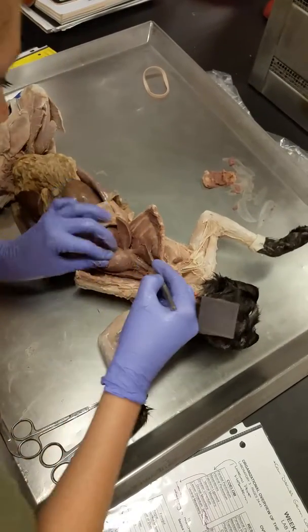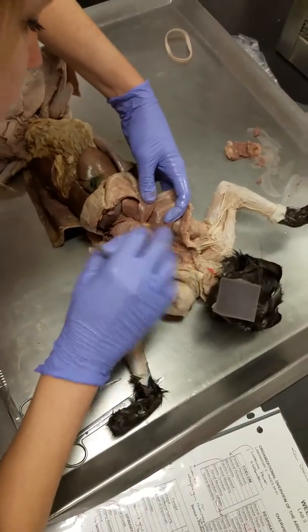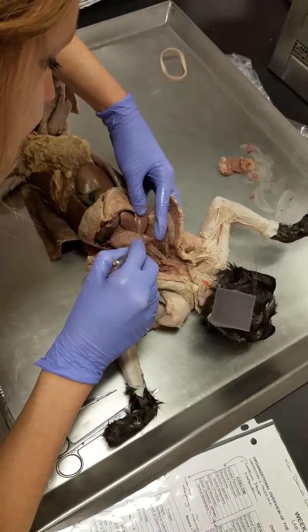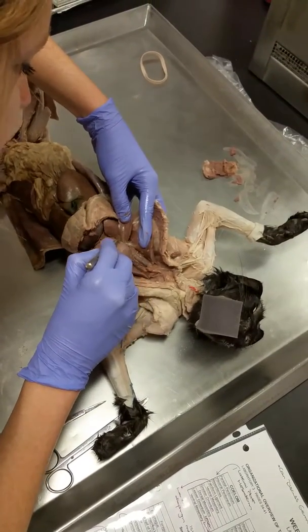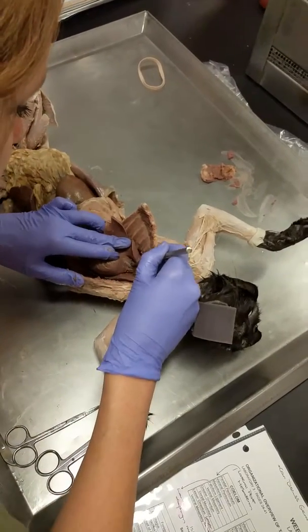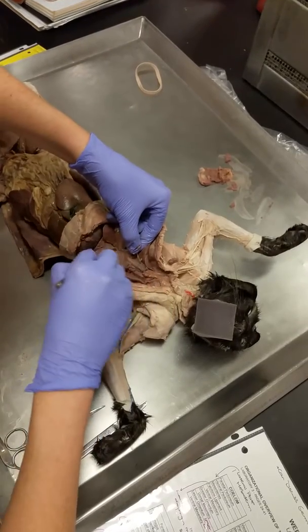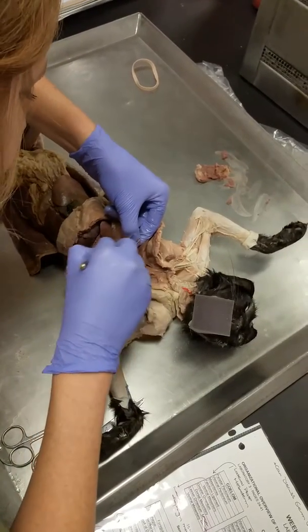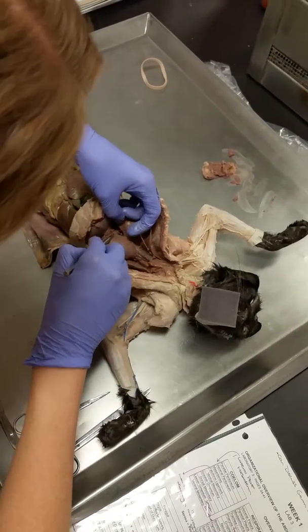And so can you see, there's one, this lung's kind of in the way. There's one running right there. Can you see that? So look for a little piece of dental floss kind of stuck onto the pericardium. And you can take a probe and you can actually gently pull that off of the pericardium. We want to save this phrenic nerve.